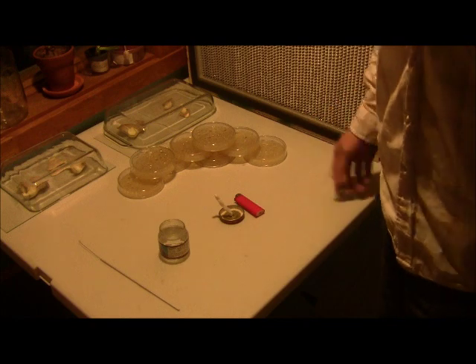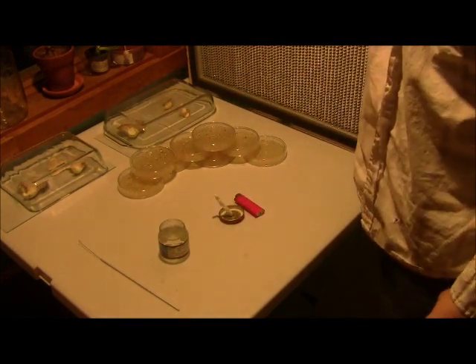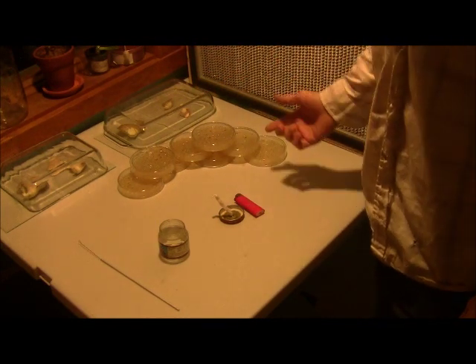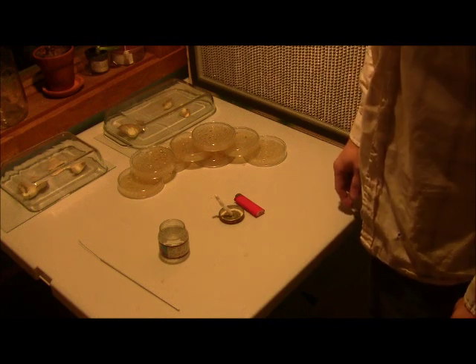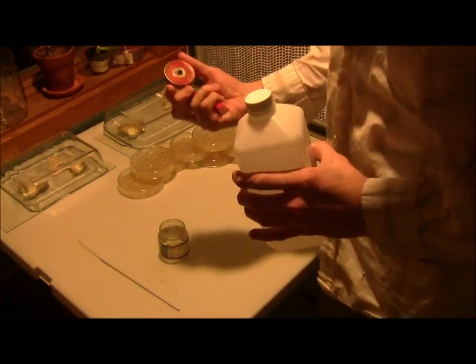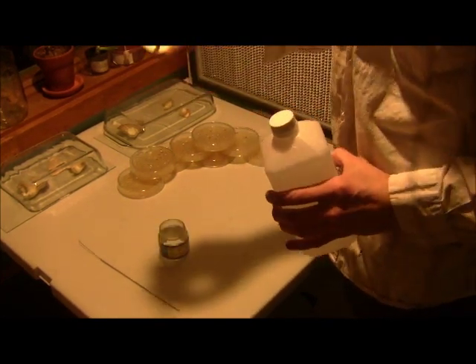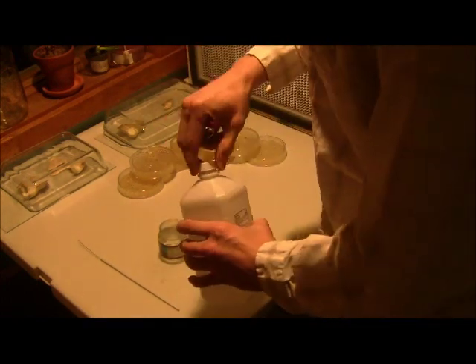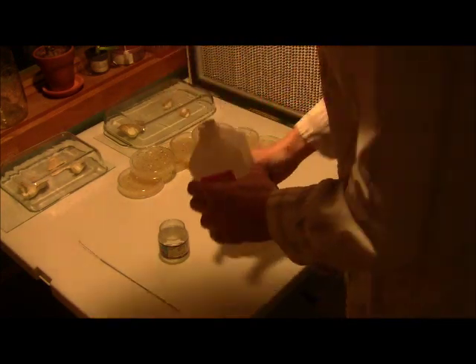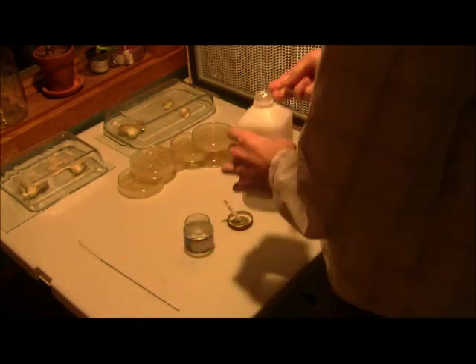We're back — it's been about 24 hours. I poured agar last night and it's sitting here set up. Now I'm going to transfer one of these spore prints into the petri dishes. I've got my homemade alcohol burner here — a baby food jar with a little piece of cotton. I'm using 91% isopropyl from Walmart, which is great for sterilizing and for firing up a homemade alcohol burner.